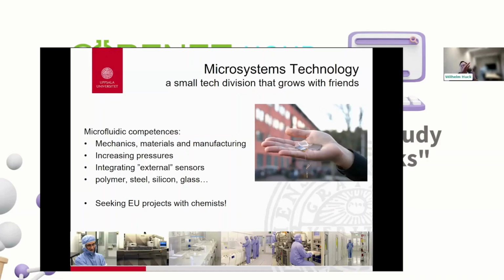And then what you could do is, instead of going top and bottom, you would go left and right, left and right, left and right. And that would be my second input, for example, dihydroxyacetone. And you would do the same thing. You would say, okay, if it's black, it goes up.